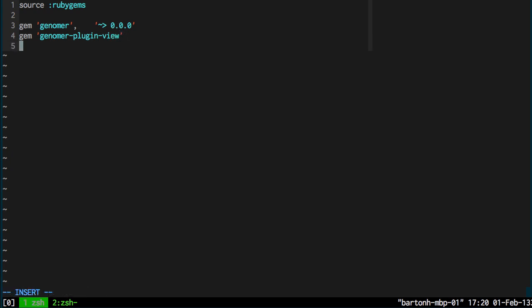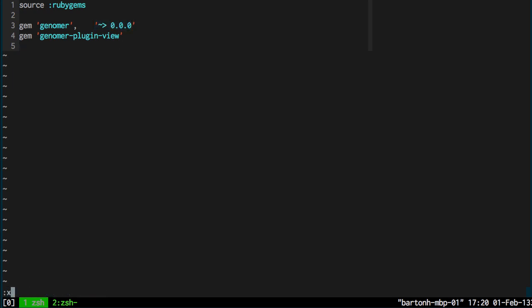And all commands are in this format where it's the gem followed by the name of the plugin in quotes. And if you wish to you can use this format here to specify what version of a plugin is installed. But if I leave off this part here then the latest version is installed. So I just add that to the gem file.